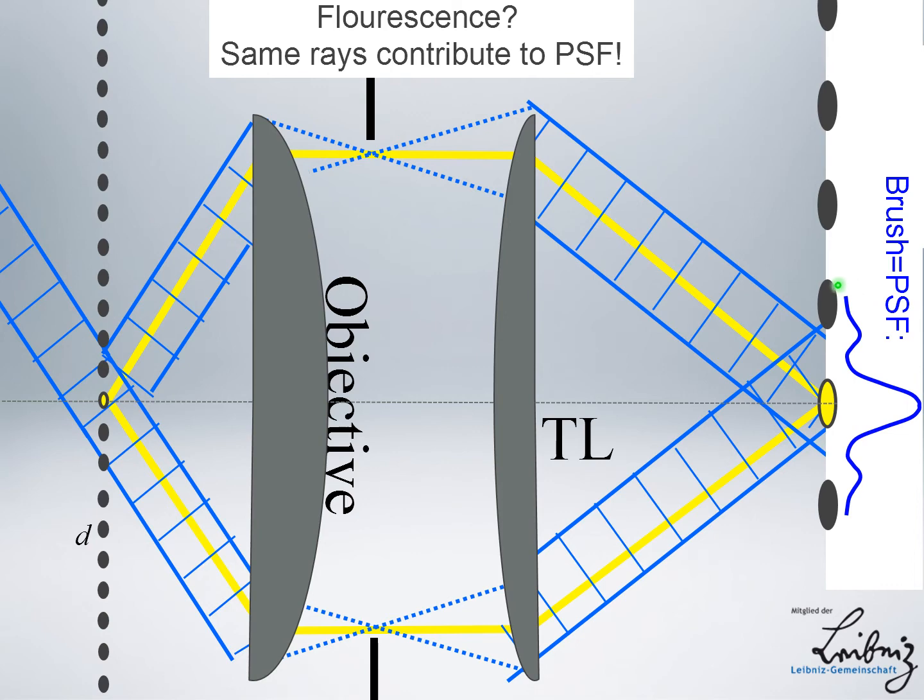And therefore, it gives rise to a sinusoidal component, which, in its sum with lots of other sinusoidal components, is part of the point spread function. Now, the interesting bit is that these two rays are exactly the same two rays as in Abbe's picture that form the highest frequency part of the point spread function.